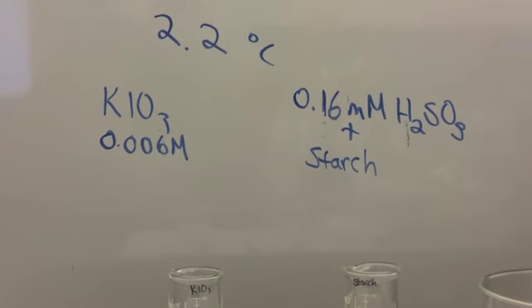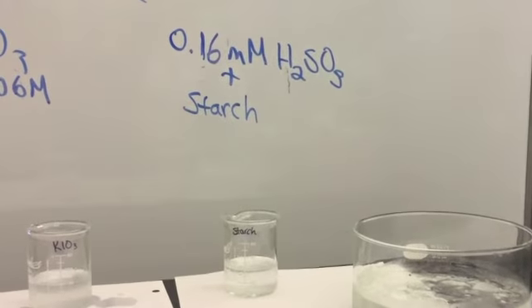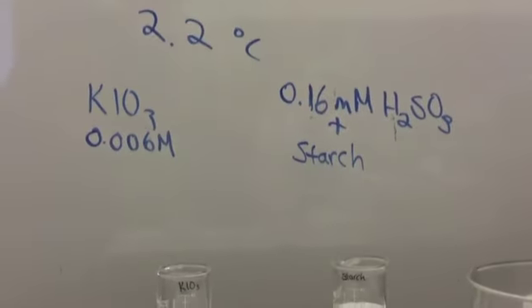Now let's look at our reaction under cold conditions. These beakers have been sitting in an ice bath and are at about 2 degrees Celsius.